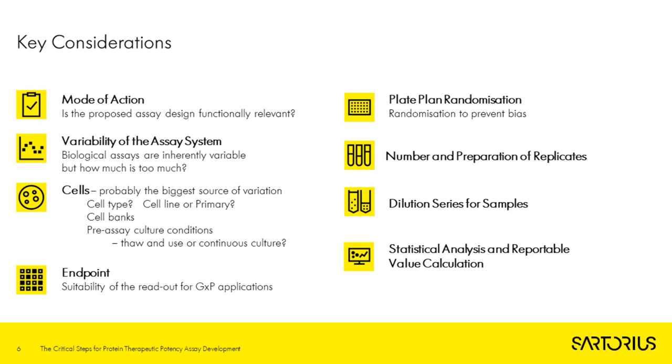Will it be manually performed, or is it going to be using a robotic liquid handler system? If the plates are going to be manually prepared, then we need to strike a balance with enough randomization to prevent any position effects and what can be feasibly performed by hand on a routine basis. We don't want to introduce any more capacity for error by having a very, very complex randomization on our plate plan.